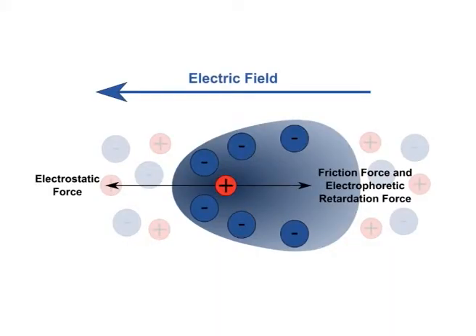Introduction to electrophoresis. Electrophoresis may be defined as the migration of colloidal particles through a solution under the influence of an electrical field. Electrophoresis basically is the movement of dispersed particles relative to the fluid under the influence of an electric field. It is mostly known as an electrokinetic phenomenon. The technique of electrophoresis was discovered by Reuss in 1809 when he experimented that soil particles dispersed in water migrate under the effect of an applied electric field.